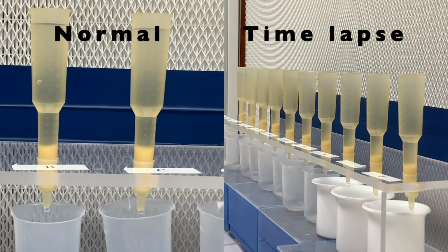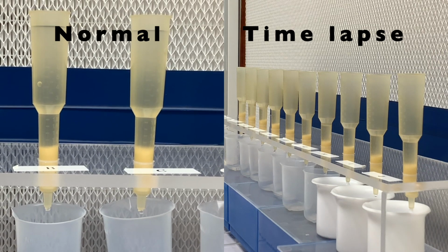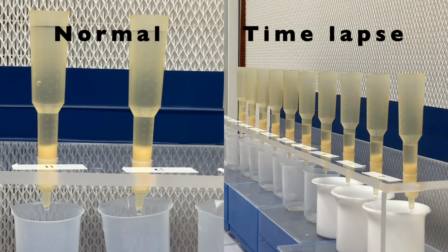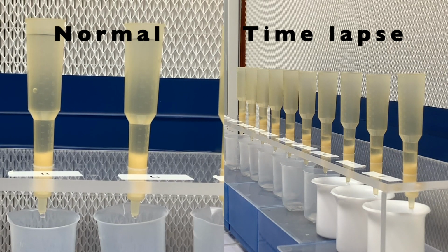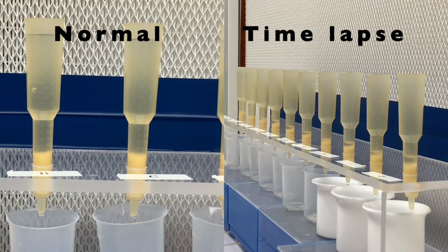This time-lapse video speeds up the dripping by a factor of 10. The column is shaped so that the solutions pass through slowly, draining out the bottom of the column one drip at a time. This gradual process is key so that the eluent slowly percolates through the resin and gives plenty of time for the analyte atoms to react with the resin, whether forming or breaking bonds.